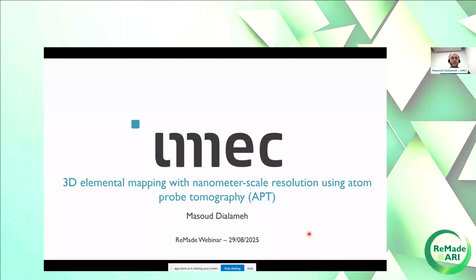In today's webinar, I would like to give an introduction to atom probe tomography for those users or potential users of the project who are not familiar at all with the technique. The title of today's presentation is 3D elemental mapping with nanometer scale resolution using atom probe tomography.